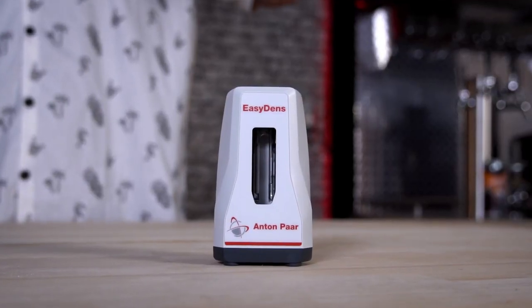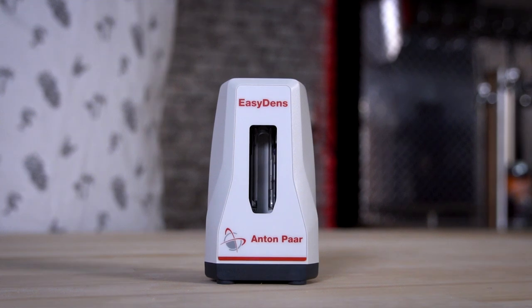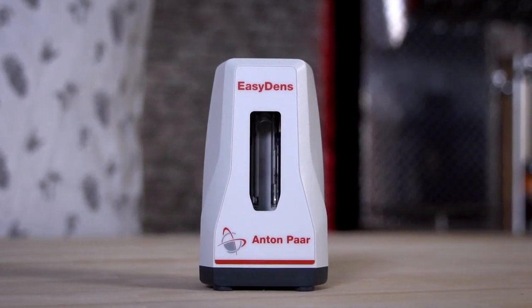The EasyDens allows you to take highly accurate measurements at any part of the brewing process, even when alcohol is present. I've been using one both commercially and at home for many years now, and I'm going to go through how to set it up, walk you through using one, and tell you why I love it.